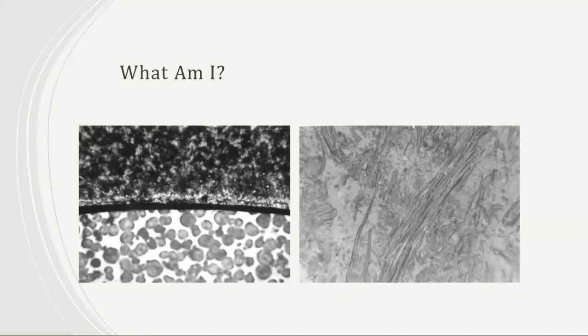The image on the left is actually the boundary between the stage and the phenolic resin material itself. So your sample is not even present. Then when you're looking at the image on the right, that is what a phenolic resin looks like.